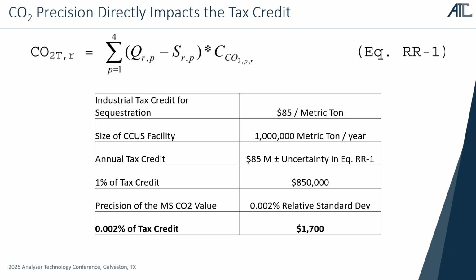Thanks for the presentation. My question, looking at the whole carbon capture systems that you showed, isn't a mass spec a bit of an overkill? Particularly when it seems like you could do the job using, let's say, a GC, for example. And since you're not using a GC with the mass spec, which means you're not separating the compounds before it goes to a mass spec, doesn't that make the analysis more complicated because now you have to think about the other signals coming from the other compounds in your stream? So I'd like to know your thoughts on that.